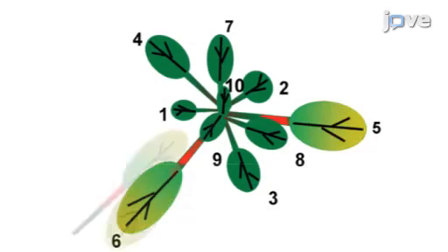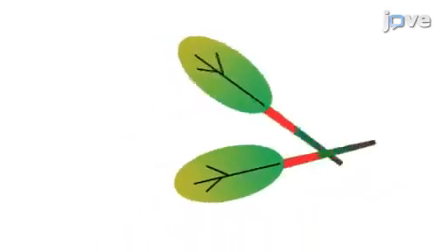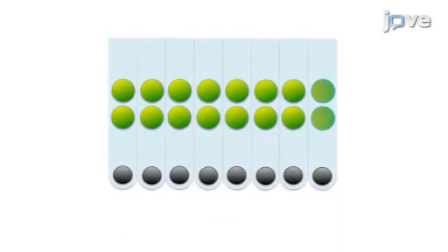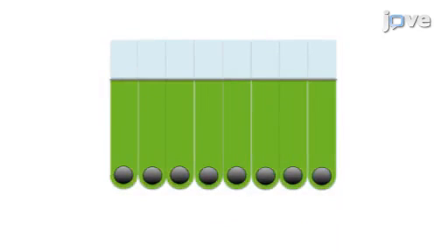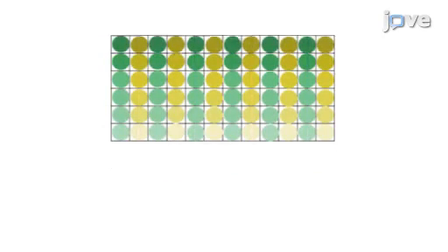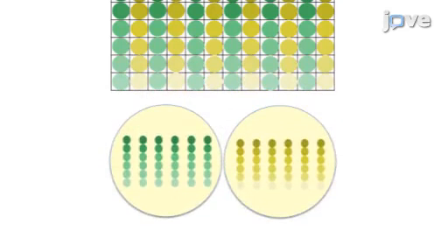The second step is to obtain discs of infected leaf tissue after the development of disease symptoms. Next, the bacteria are extracted from the leaf discs through high-throughput homogenization. The final step is the serial dilution and spotting onto bacterial counting plates to enumerate colonies.